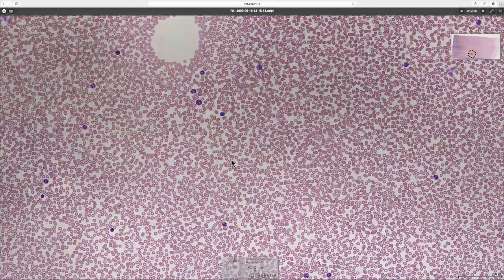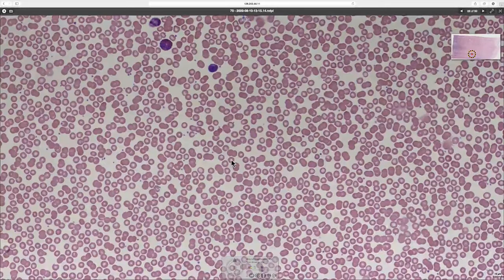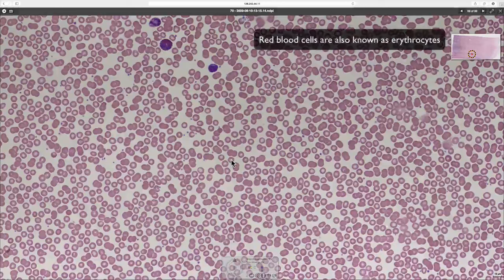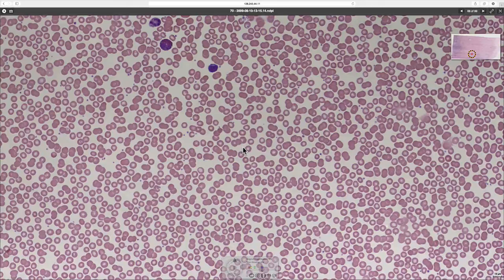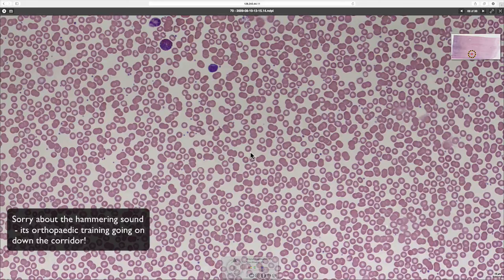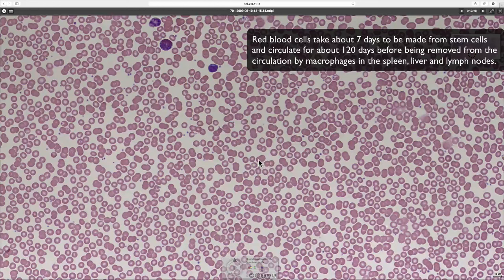The red blood cells look paler in the centre because they are biconcave discs, which allows them to flow through smaller vessels and capillaries — they need to fold over on themselves a little bit to fit through. In terms of their morphology, there's no detail visible inside these cells. They just carry haemoglobin; there's no nucleus and no organelles present, which accounts for their bland appearance.